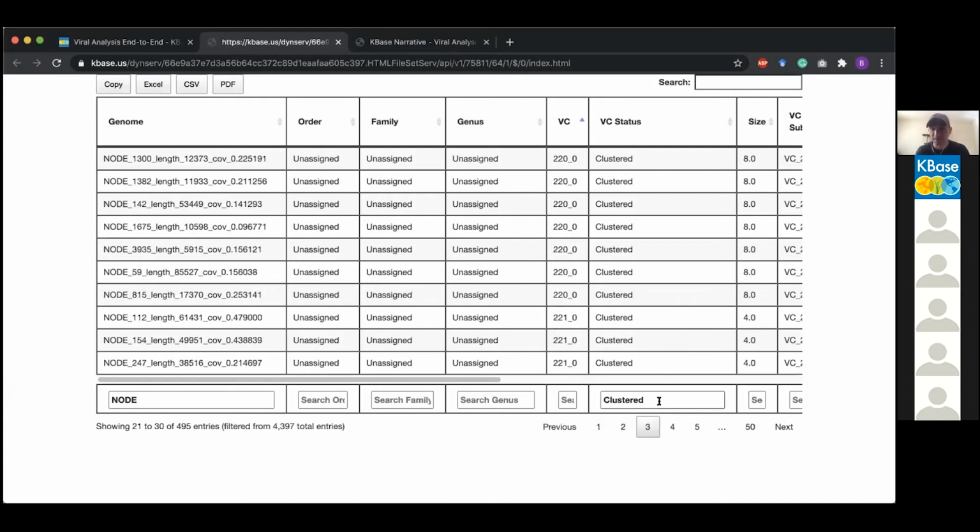And you could do that. 221, there's 4. And so I count 1, 2, 3, 221s, 4. Here's an example.